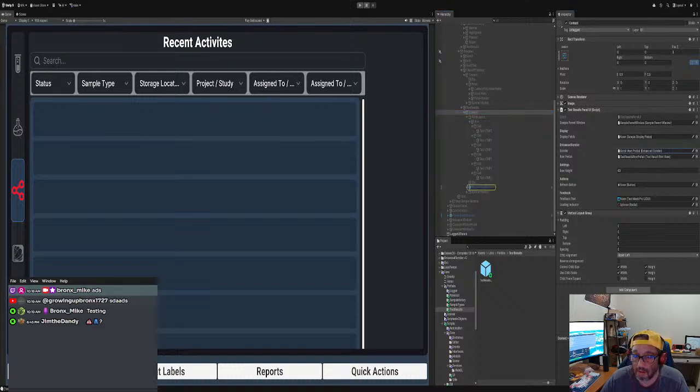Okay. We don't need the display field. We could just get rid of that. I'm just going to get rid of that, because we could just tab to the next one and we forgot a value. All right.